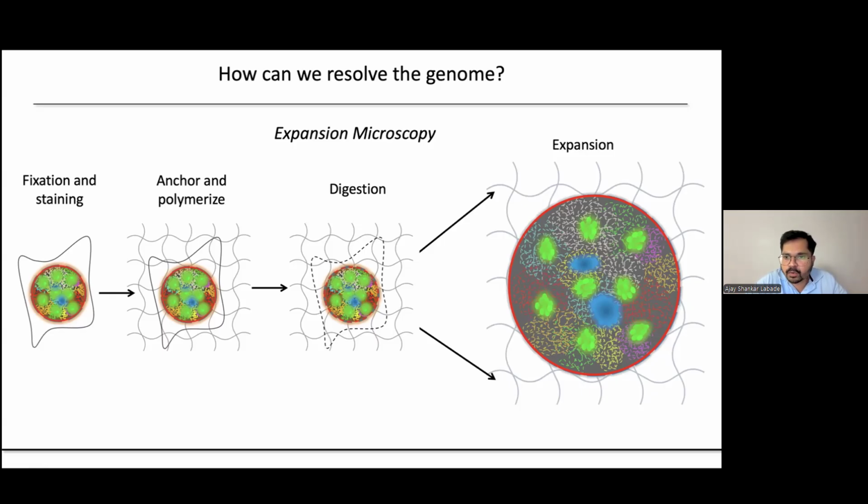So in this case, the protein is also an antibody, which also has a fluorophore on it. And since the protein was chopped, the antibody was chopped into smaller peptides, it isotropically expands, and we get very, very good resolution of what is present inside the nucleus or a cell. So this is expansion microscopy, but our challenge was to characterize whether it is causing any anisotropic change.